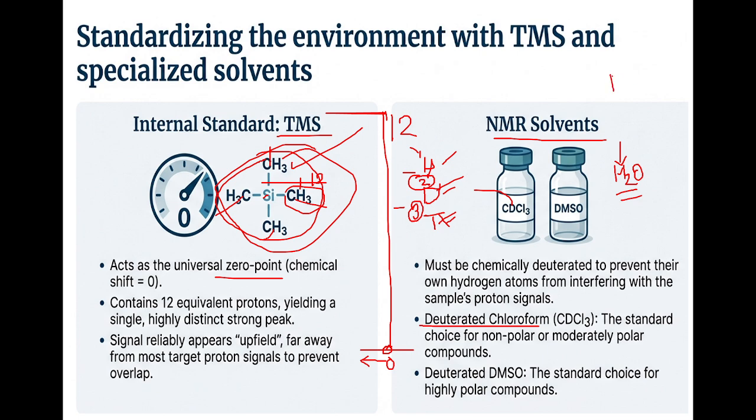So instead of H2O, we use D2O. D2O is heavy water. What's heavy water? It's water which is a little bit heavier than usual water. Is it drinkable? No, I don't think so. So don't drink it. It's not like usual water, which you can find everywhere.